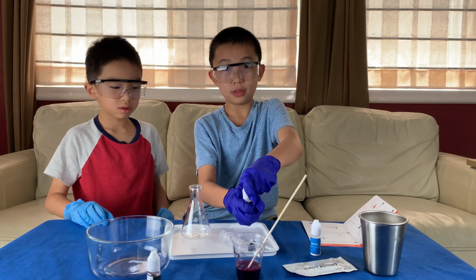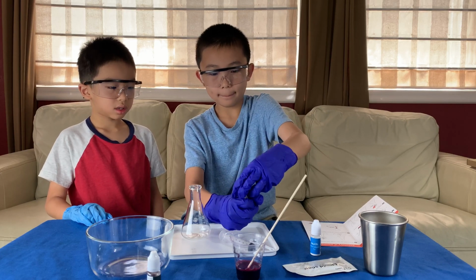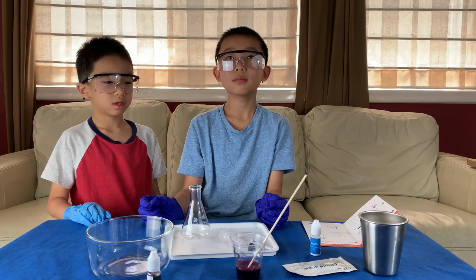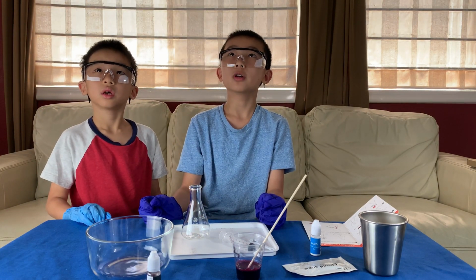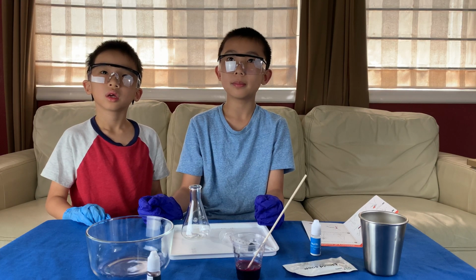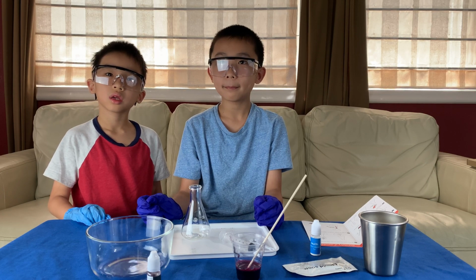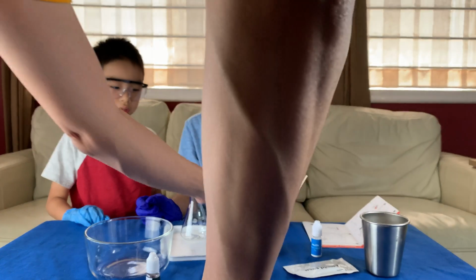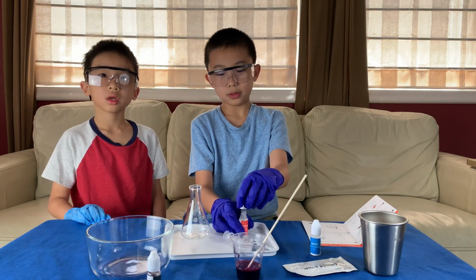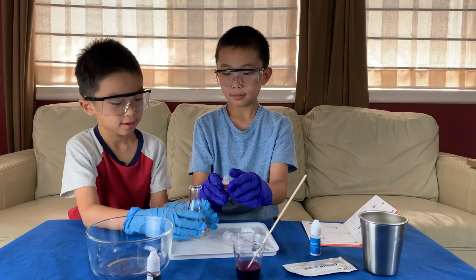Watch out. This causes serious eye irritation. You help with it? Sure. Put it down and I'll carefully pick it up. Watch out for your eyes. Put it down carefully. Okay, we're going to pour the whole bottle of citric acid in carefully. Slow.